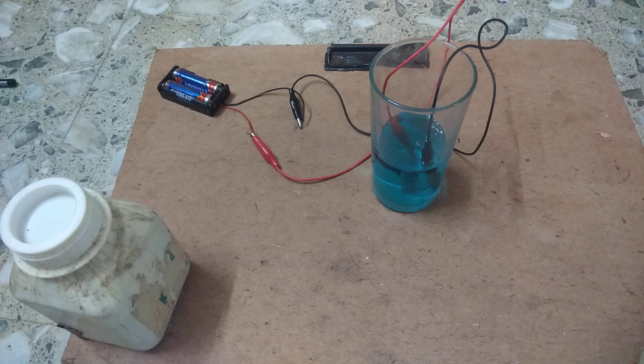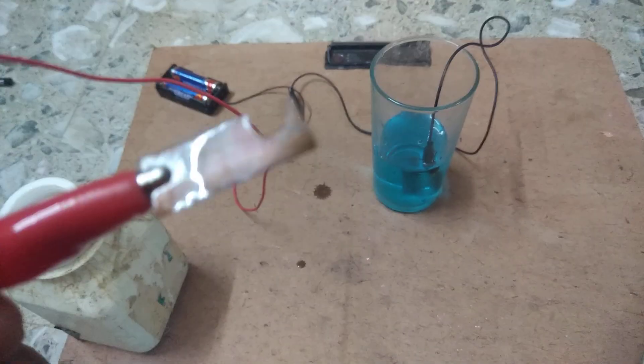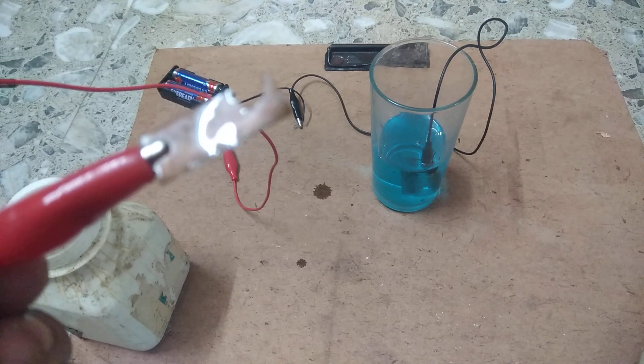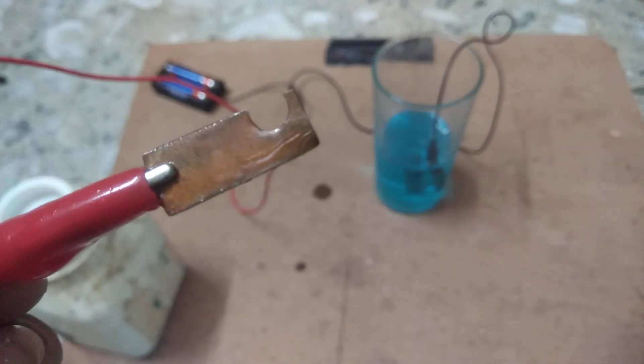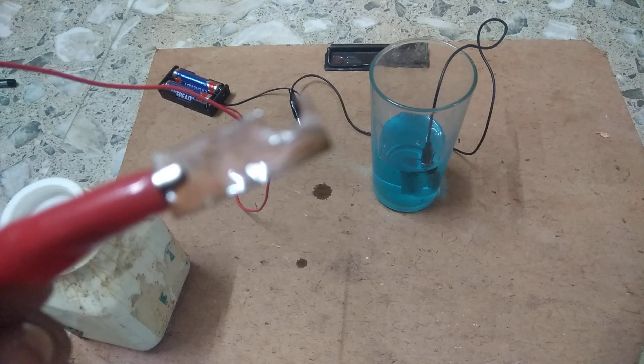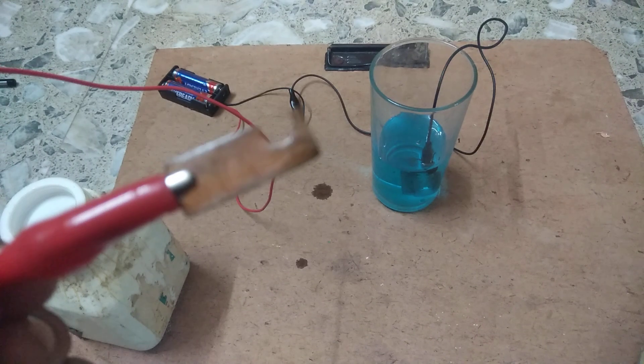The red wire is the positive terminal and the black wire is the negative terminal. I took a copper metal and attached it to the positive terminal — that means this copper electrode is the anode.